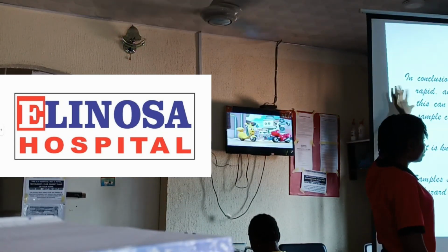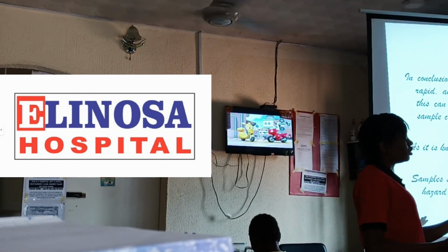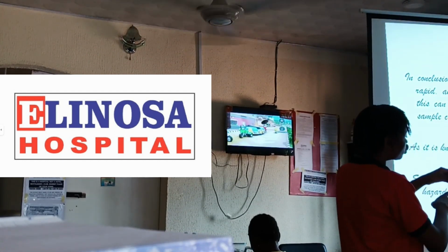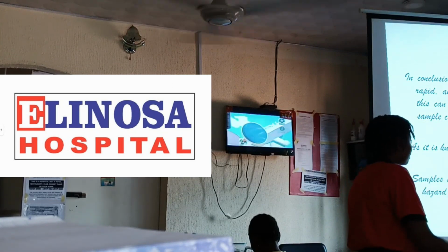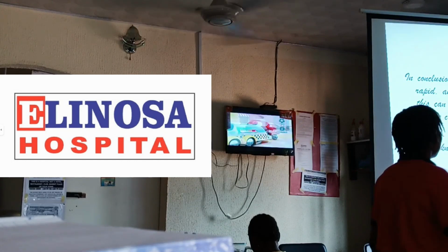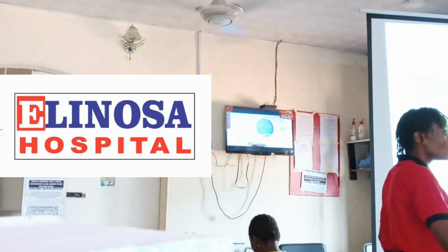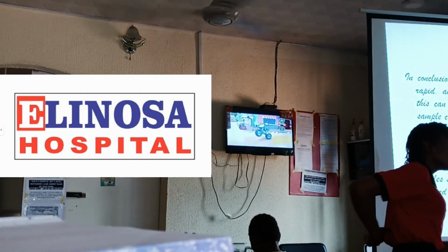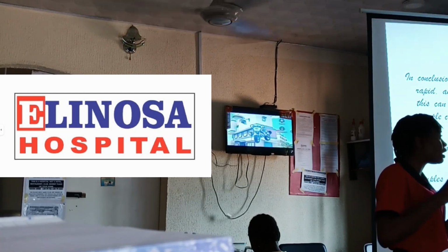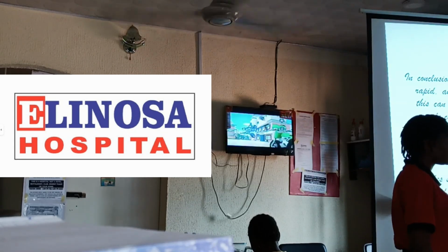Like that CSF I was talking about. It is contained in the laboratory and you find that the CSF is just small like this, and you start treating it anyhow, you just throw it. If you see how they collect CSF from the patient, it's very, very painful. You have to screw the needle through the vertebral column and collect the sample. And most times those samples come in a minimal amount. So please let samples be treated as gold. Why? Because they can actually save lives.